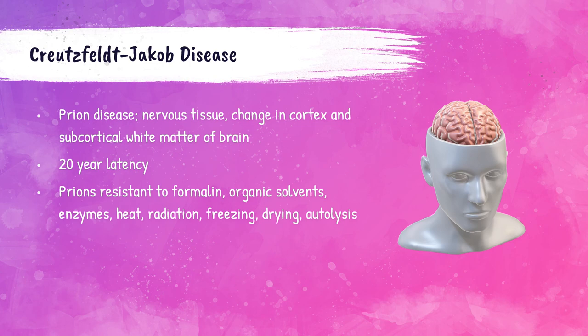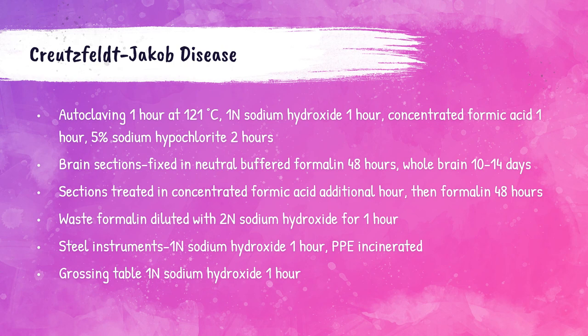Creutzfeldt-Jakob Disease, or CJD, is a prion disease that infects nervous tissue, leading to changes in the brain cortex and subcortical white matter. It is a fatal disease characterized by changes in mental abilities, can have a 20-year latency, and is very resistant to formalin, organic solvents, enzymes, heat, radiation, freezing, drying, and autolysis. Special care needs to be taken with nervous system tissue, especially brain tissue.